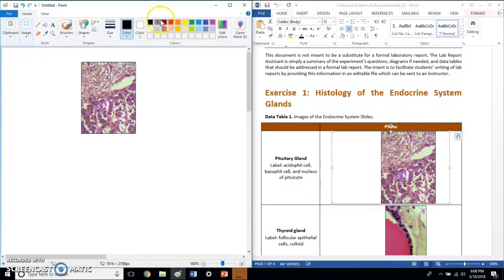You have the option of choosing different colors depending on the background of the image. We have blue, dark blue, and pinkish tint right here, so black would be a good color. You can choose different colors. If this was blackish in color, you'd go for a wider line or a light blue line so that way it could be visible.